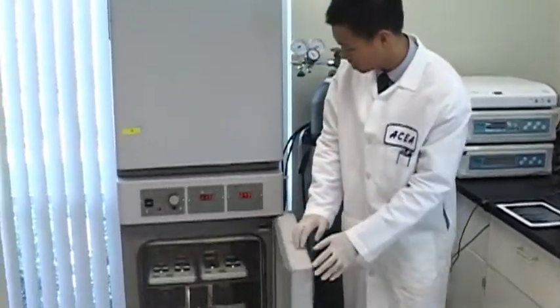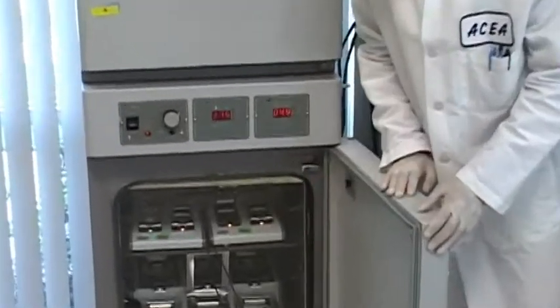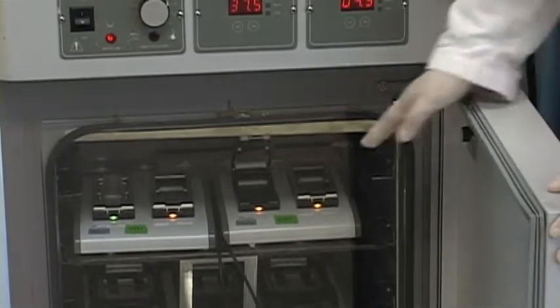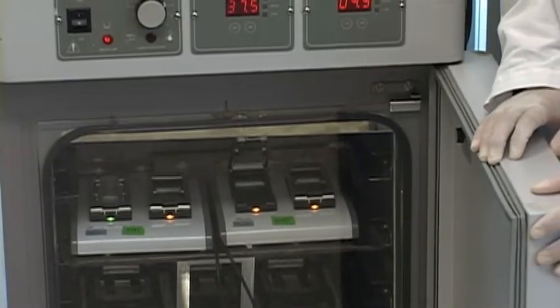And so in the incubator, I have the iCELLigence station here, already pre-equilibrated to 37 degrees Celsius and 5% CO2. And as indicated by the orange light, it is in standby mode and ready to go.